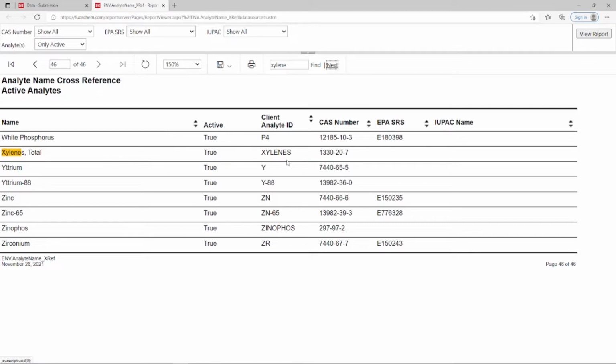Additionally, if we were submitting a custom PAL for our EQAP for something like xylenes, and chose a xylene option that didn't match our EQAP, the PAL wouldn't connect with that analyte because the valid values for each xylene option are different. We would need to update the custom PAL for consistency. Hydrocarbons are an even more expansive group and require similar care when making a selection.